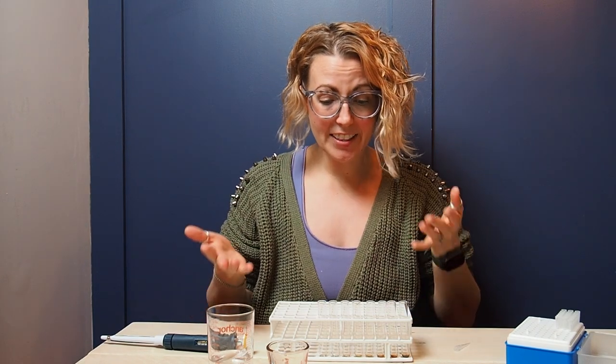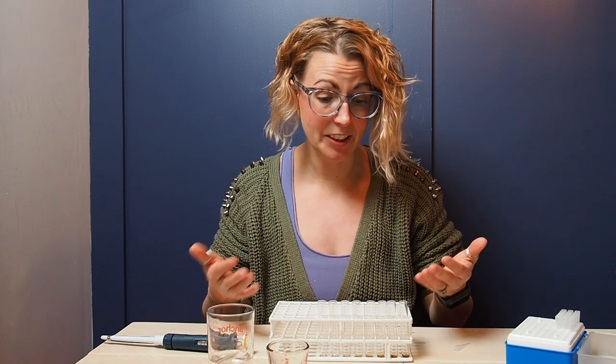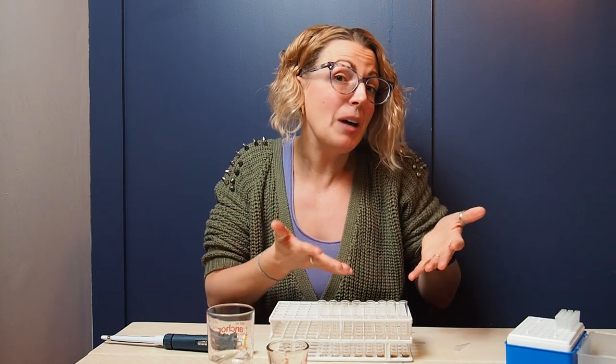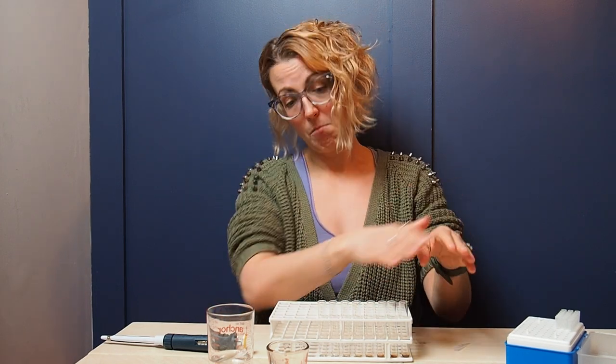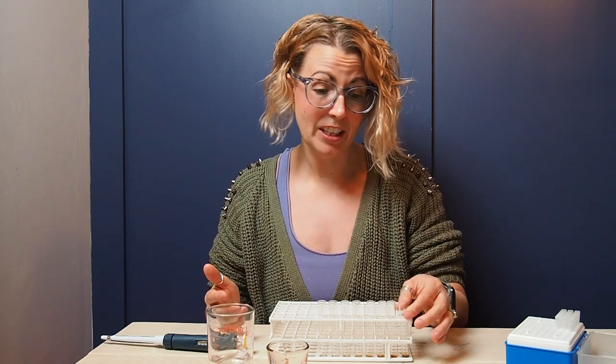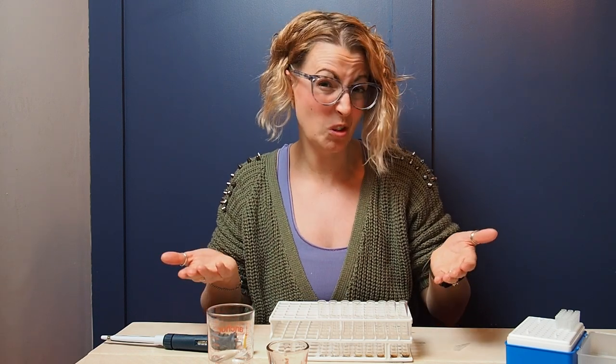As you can see, today I did my titration over eight samples. It's important to note that the more samples you have, the more accurate a curve you're going to get. A lot of the time people like to cut this short and only do three or four titrations — and you might end up in an okay place — but by having more samples you get a better curve and therefore a better representation of your best concentration. It's also important to note that doing this with more samples the first time will save you reagent, because you only add antibody into the first sample. If you cut your titration short and have to repeat it, you're going to use twice as much antibody as if you'd just done the full eight or six the first time.